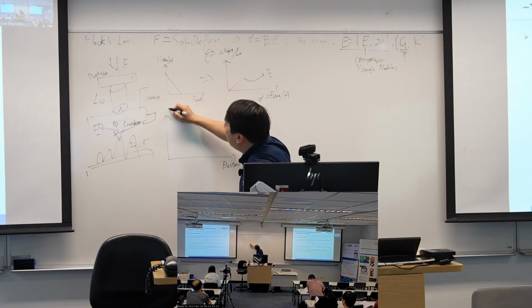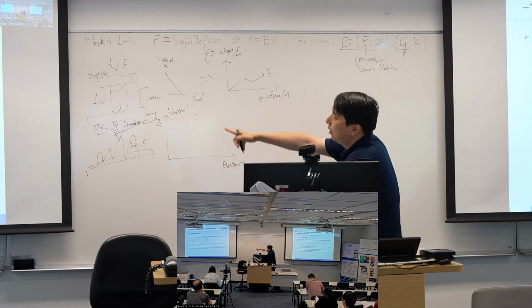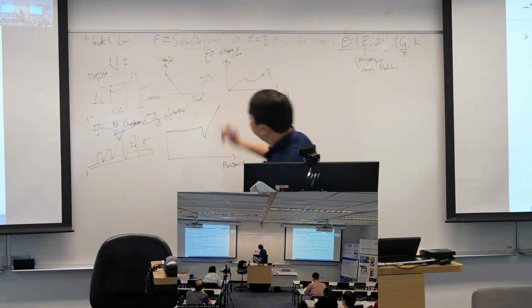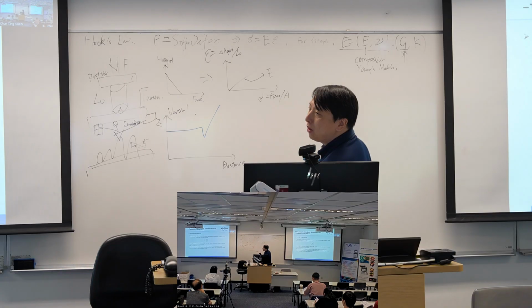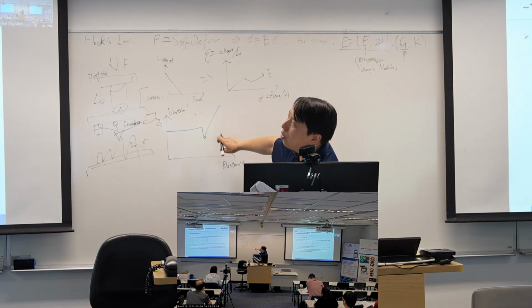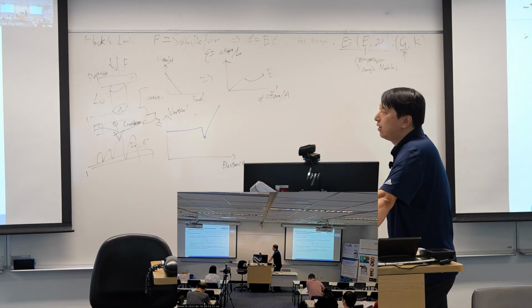So we measure vertical against distance for our AFM setup. So we will capture a force curve. In a typical force curve, we will see this snap-in, which is due to the attraction force between the tip and the sample. And this is a quantum chemistry concept.